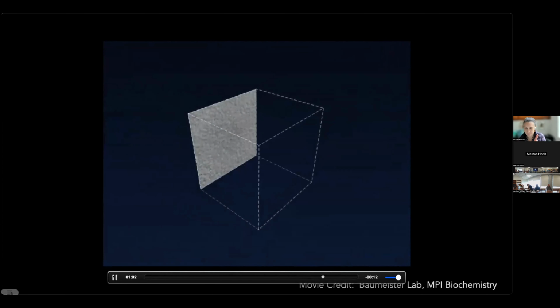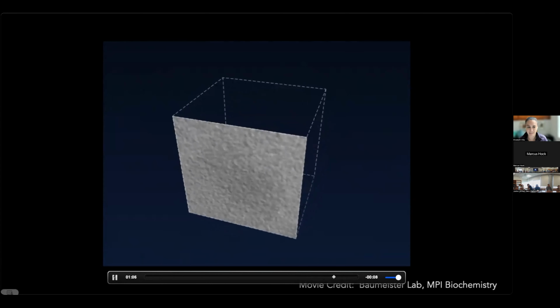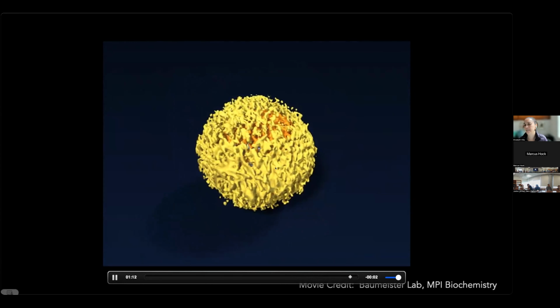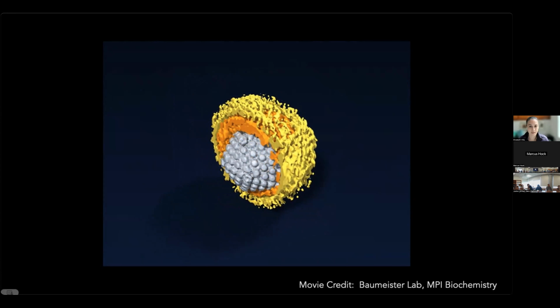It's a mesh of values where, again, pixel intensity corresponds to mass. And to these data, we can do annotations and segmentations to try to figure out what's what. So that's basically tomography.